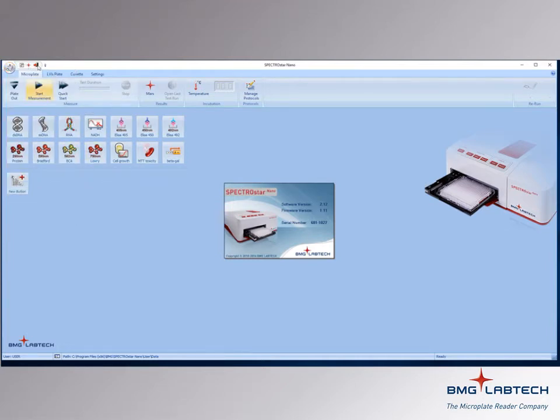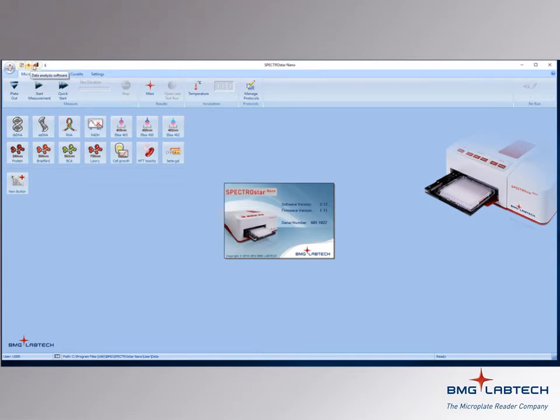Small icons provide access to the script function, MARS, or can close the program.